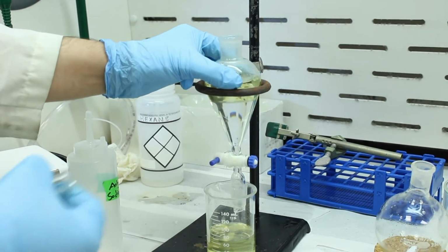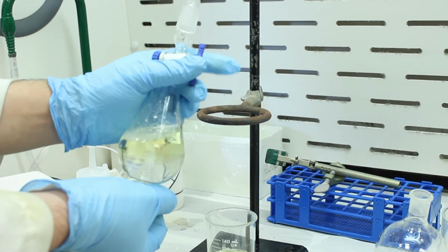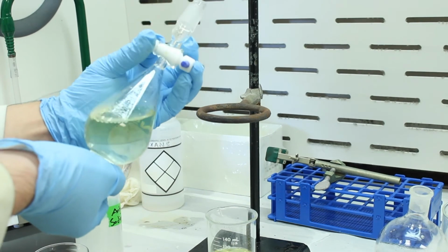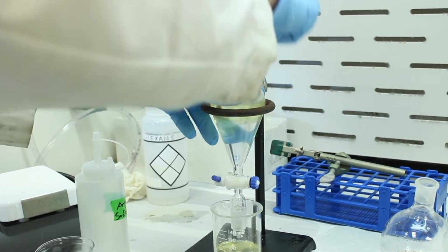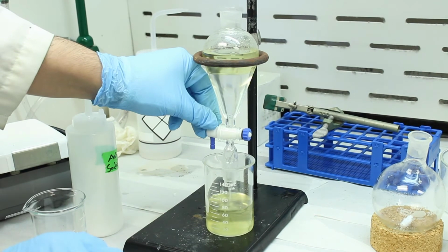And as with previous labs, we shake and vent. Here you really have to be careful to vent frequently, because ether, as we stated, has a very high vapor pressure and likes to boil away. Okay, so no emulsions here, nice clean separation. So we can just drain away our brine.